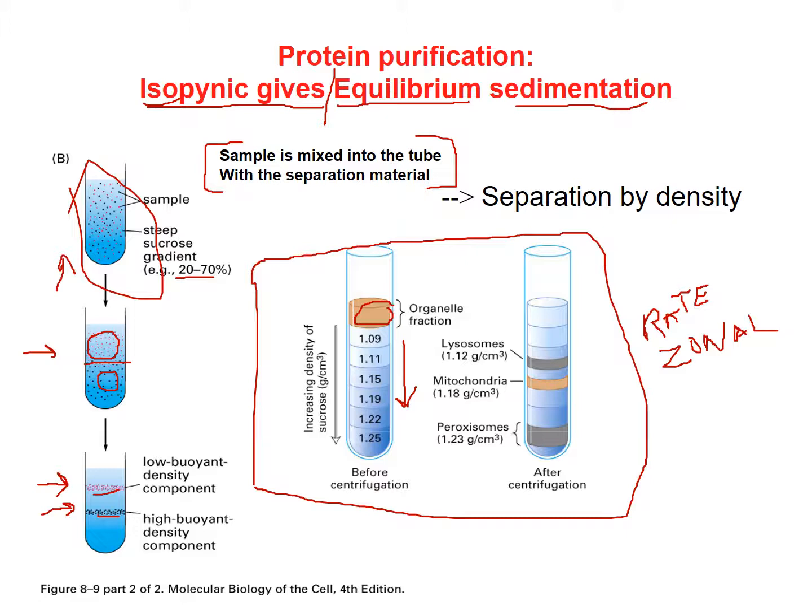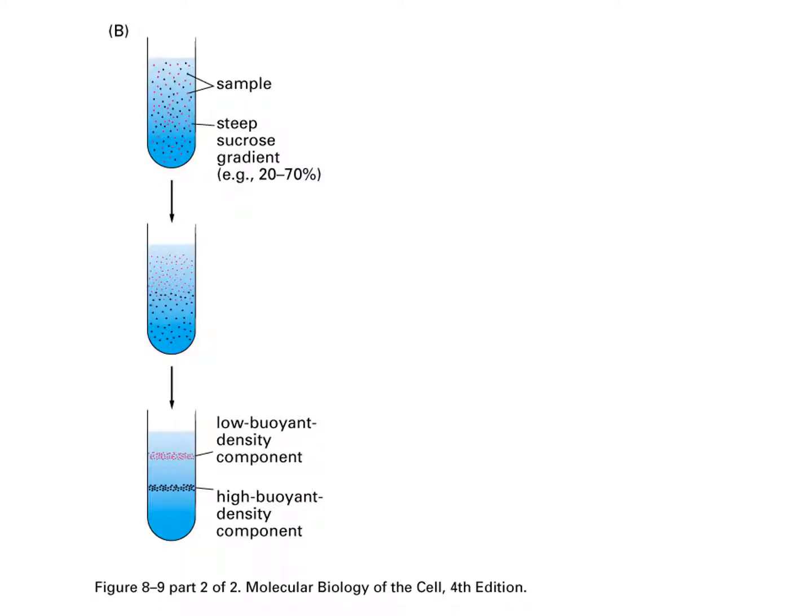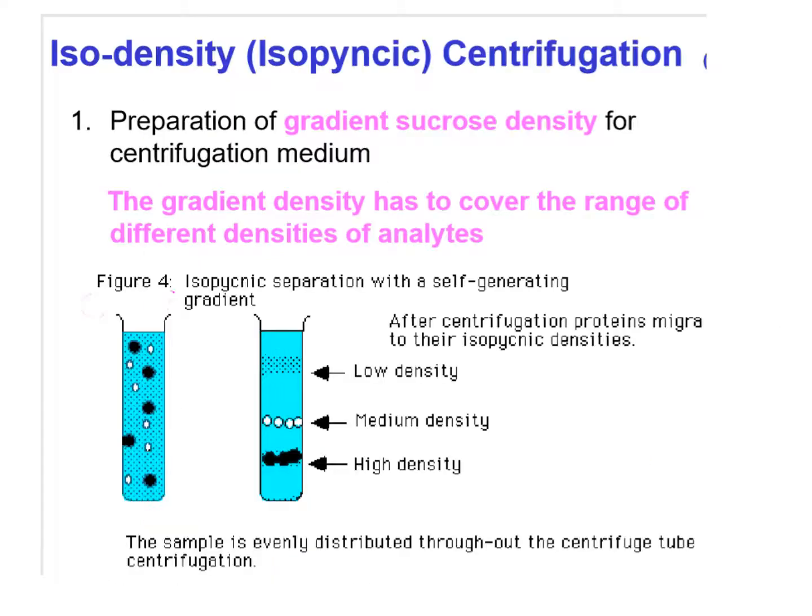So time-wise, no issue with time. Because of the way this is working, these materials stop at the gradient and can't go further. Okay, this can keep going down over time. So here it is, just showing that again, moving in and out.